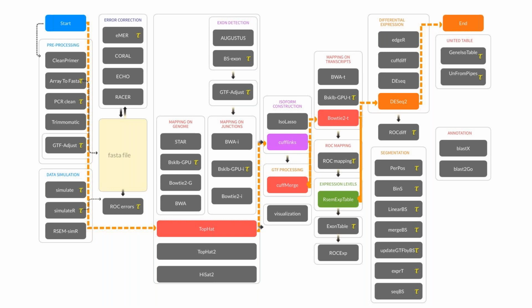The new reference file includes all of the mapping that was done in this step and the isoforms that have been identified. After that is done, now we have Bowtie2 that will use this GTF file and align the reads to the newly identified transcripts that are placed in the GTF file. After that, you have to count them. And so the green represents the quantification step, where we count the number of reads aligned to a specific region. Now, as you remember, we talked about different ways of counting. We talked about FPKM, fragments per kilobase per million. We talked about TPM. We talked about just raw count. So there are different ways to count those.